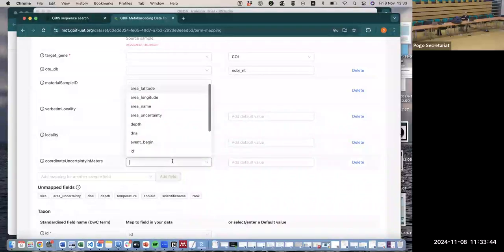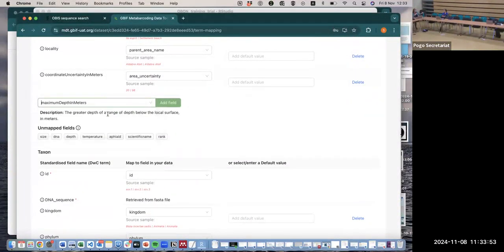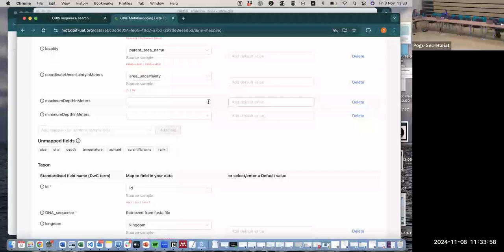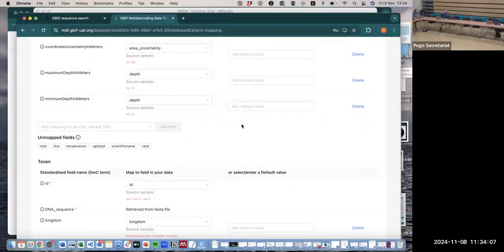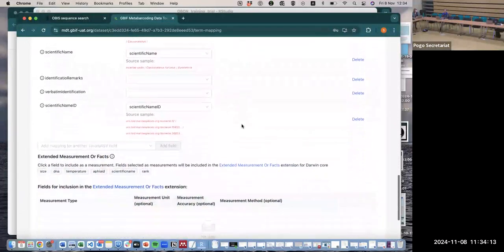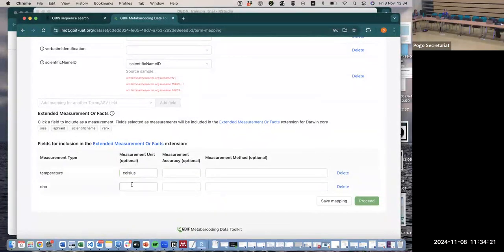Gotta also remember the regions that we're looking at are highly conserved in insects and arthropods. Quite often I've done crustacean work where we've mapped to Drosophila reads because that's the closest we've got. If you do any sort of LCA, one workflow I've been using recently is just a BLAST against NCBI and then an LCA on your top hits, and if there's really nothing in the database that's closely related, then you could easily get insects. Because insects are massively overrepresented in NCBI.